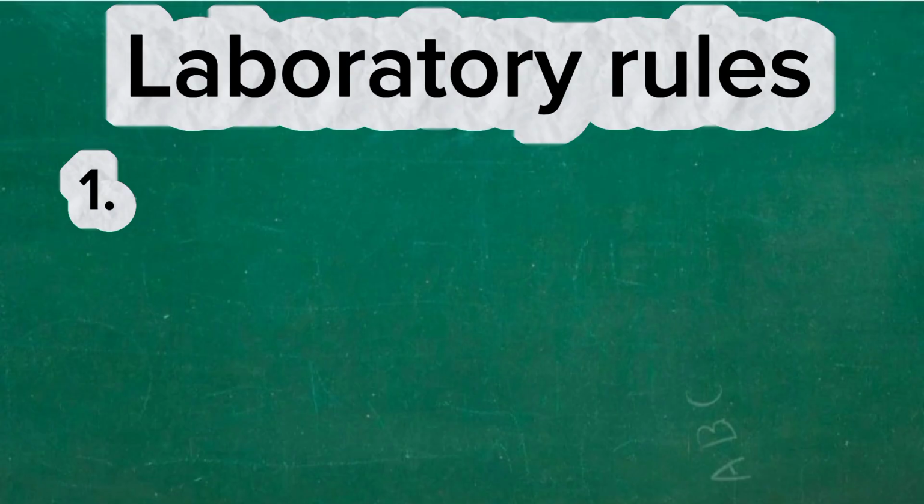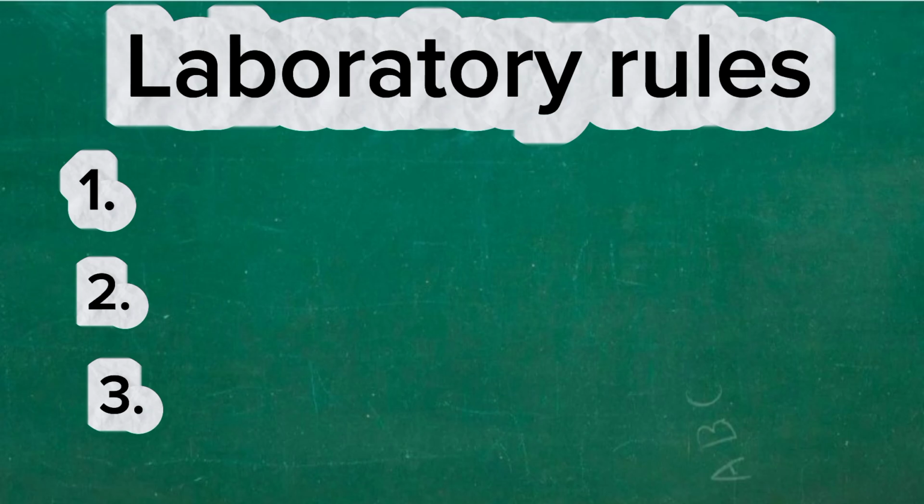Number 2, always ensure that the laboratory windows are open to allow for air circulation. Number 3, know the location of safety equipment, such as the fire extinguishers, and how to use them safely. Number 4, dress neatly and safely while carrying out experiments.